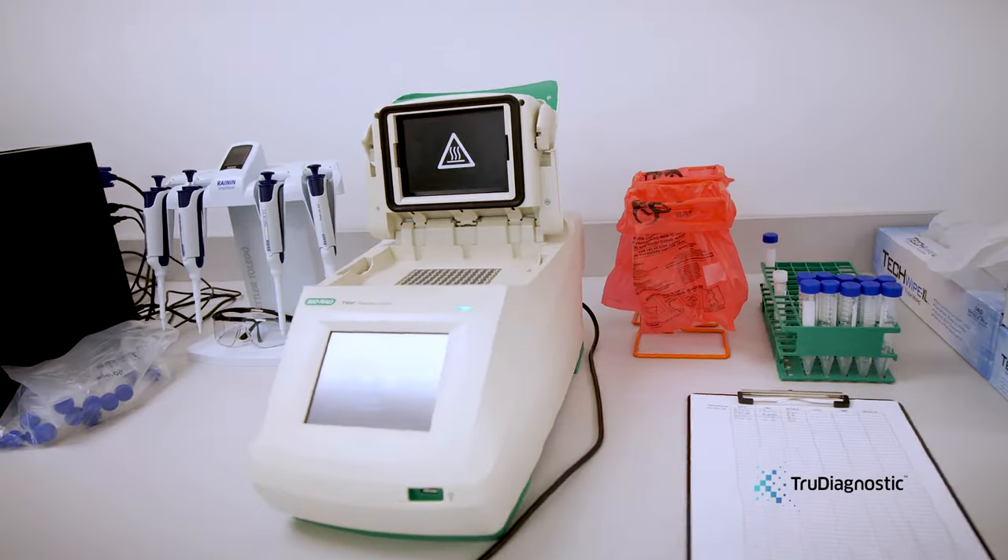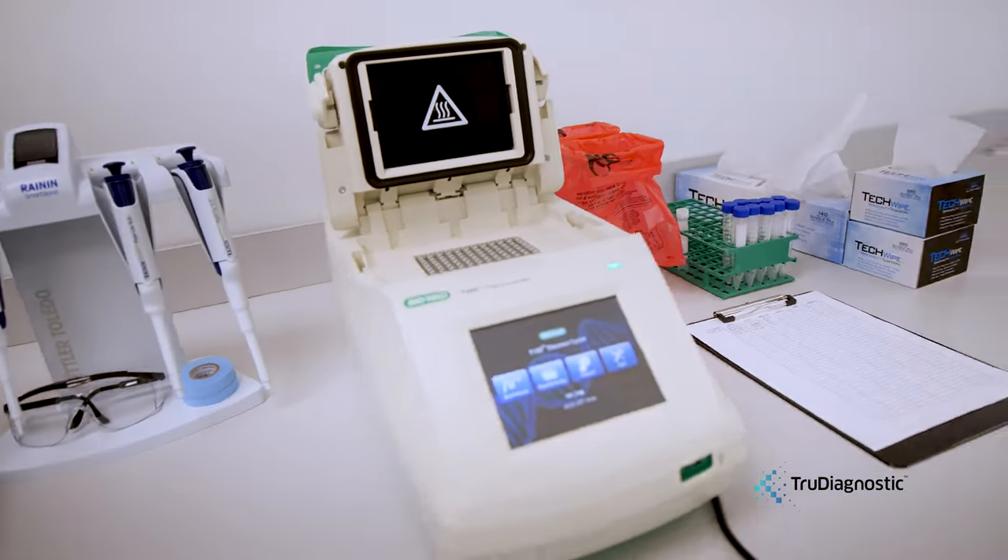Despite the fact that bisulfite conversion is the gold standard by which DNA methylation is analyzed, we're always looking to the future for better ways to do this analysis and give you a better product.